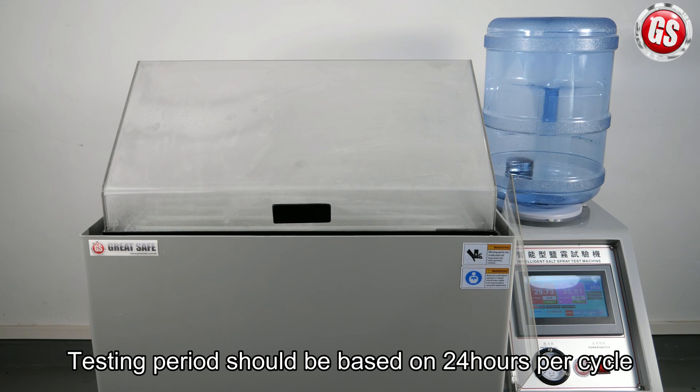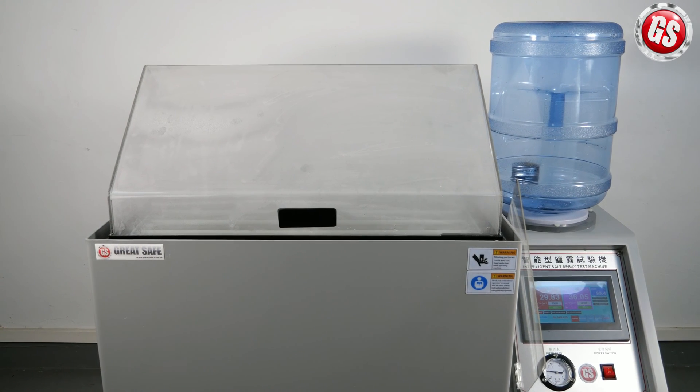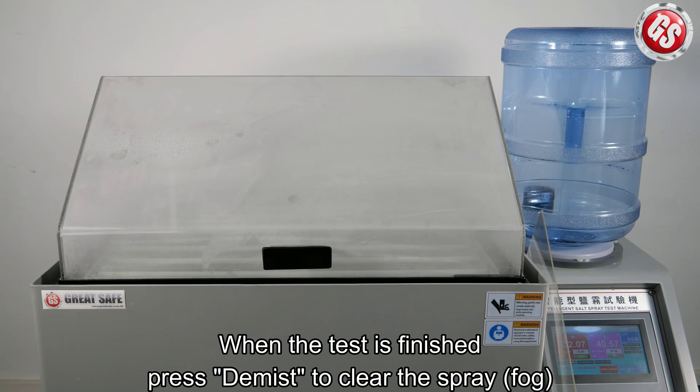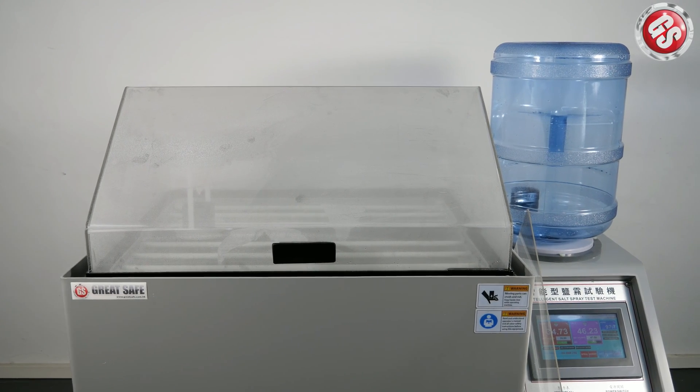The testing period should be based on 24 hours per cycle. When the test is finished, press de-mist to clear the spray.